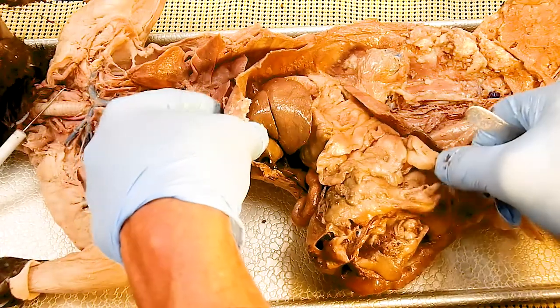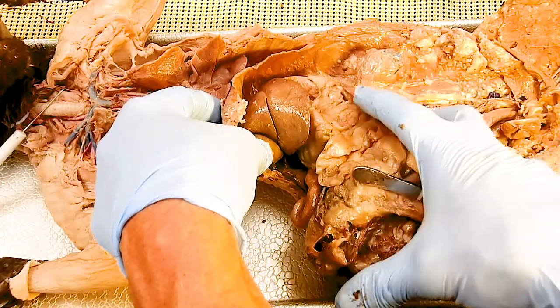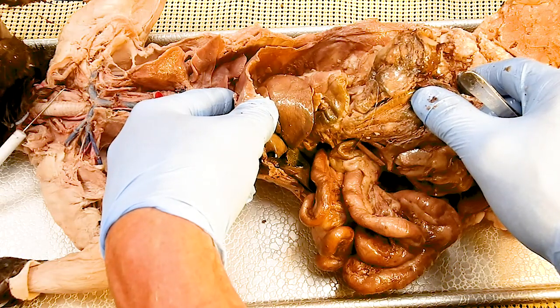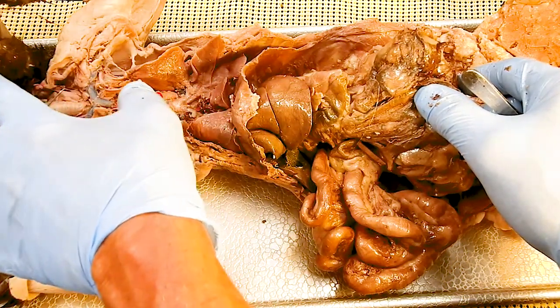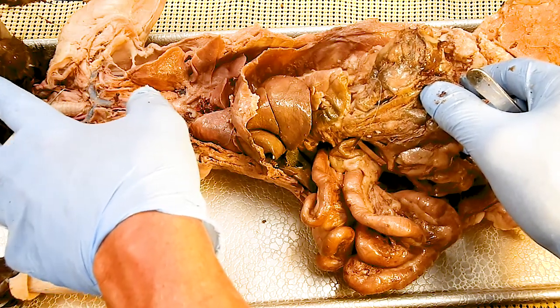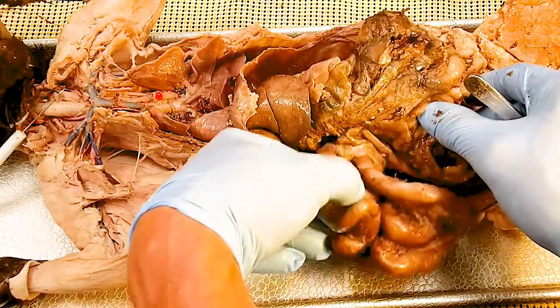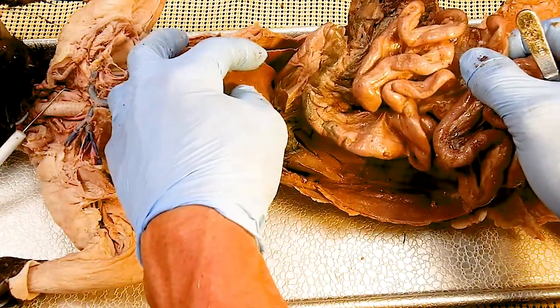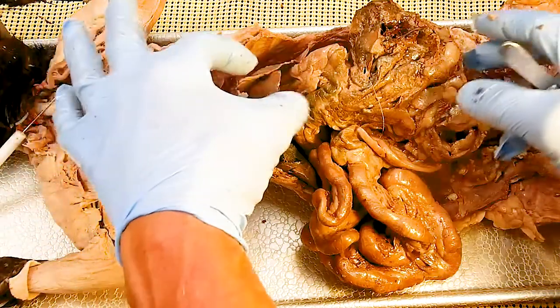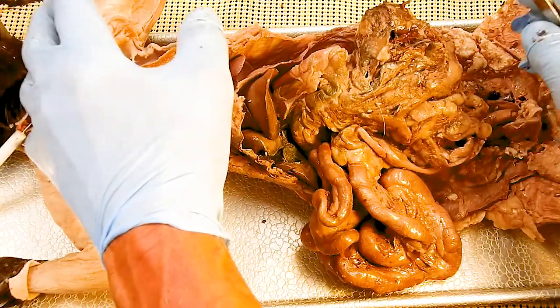Then don't forget, we'll have to look at those pig kidneys as well. Let's see. That is most of what you'll need on the cat. The upper parts, you know, the salivary glands and so forth will be on the human models. The other thing I might do, you could actually take the intestines, the whole alimentary canal out and string it out, and it looks kind of cool, but I think I'll leave it like that for now.